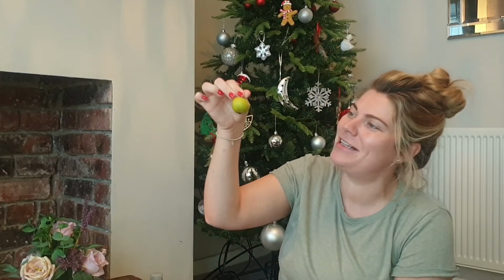Next one I will do is barium. You've probably not really heard of barium. We don't really use it much, but that's one they want you to know about. In WJEC, if I've got a solution with barium in it and I put it in a flame test, it's apple green. Not just green, you've got to say apple green. I've never even seen this one work, but somebody's decided that is the official colour WJEC want you to know about. So I've been in my garden. I've got an apple tree in my garden. What is apple green really? Apple green is barium.